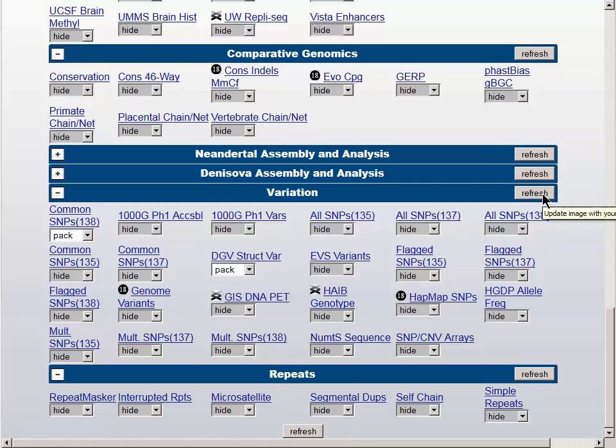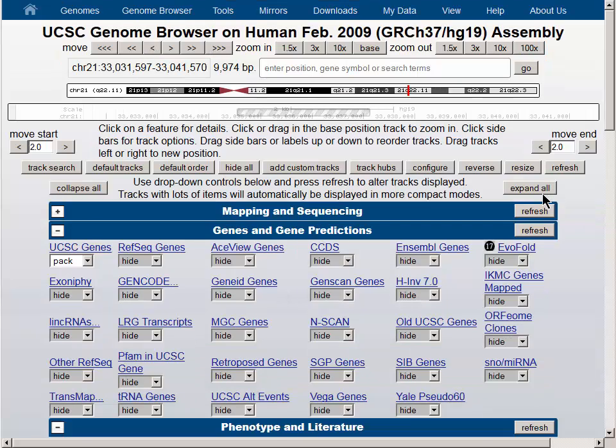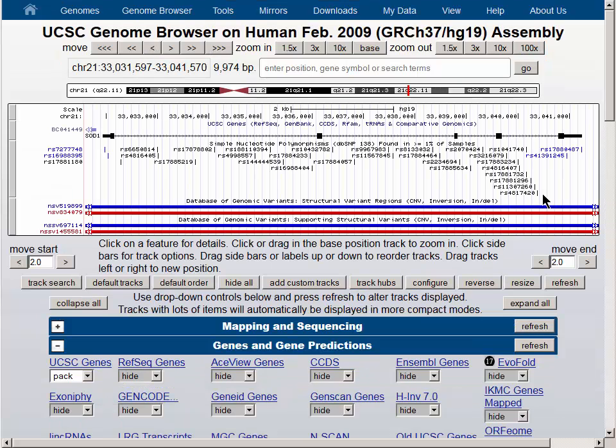You can click any one of the Refresh buttons, and the three tracks that we have selected will turn on. You will see that we are on the default gene, SOD1.